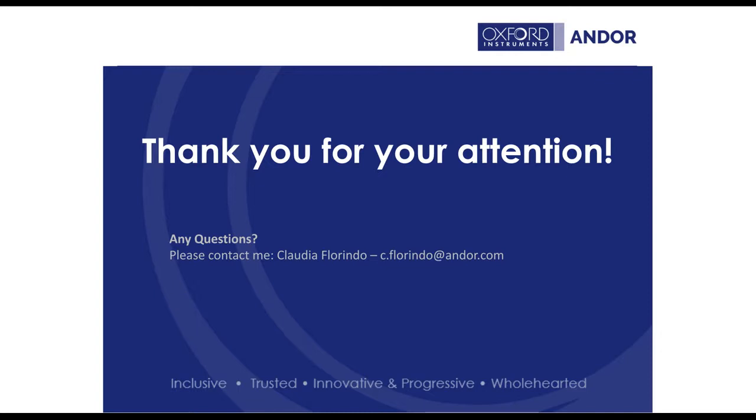Can we get XYZ coordinates information from Dragonfly? Yes. So the Dragonfly is a multimodal system that is delivered by Andor Technology, and it's a multi-point spinning disk confocal. So it is a confocal imaging system, but it also delivers other imaging technologies. So you can do confocal, you can do wide field imaging, you can do SRRF-Stream with the Dragonfly, you can do TIRF, and you can do STORM and 3D STORM.